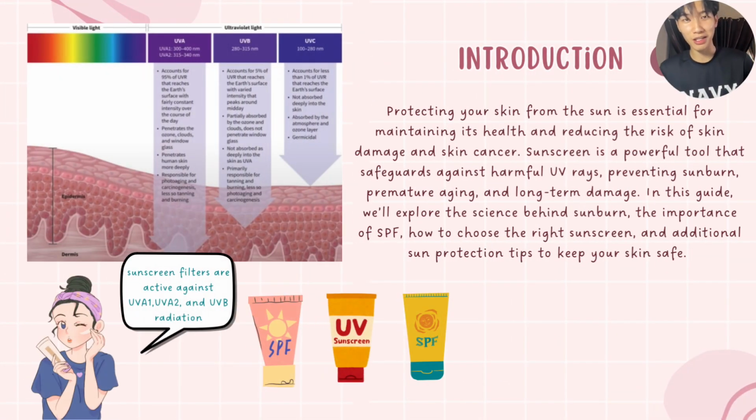Hi everyone, my name is Muhammad Firdaus Hasanuddin bin Fazil. Today I'm going to talk about thin layer chromatography in sunscreen. So first, did you know that science is all around us, from protecting your skin under the sun to separating complex mixtures in a lab? Today, we're going to talk about two fascinating concepts: why sunscreen is essential and how chromatography helps us uncover the hidden components in the mixture. Let's dive right in.